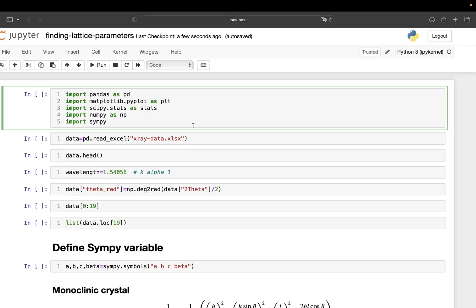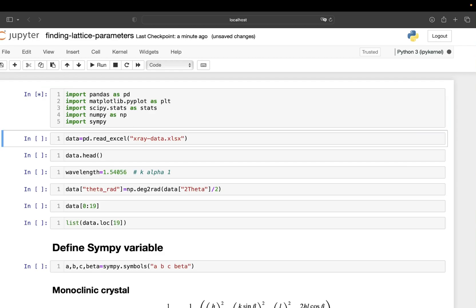Hello, welcome to this channel. In this video I'm going to explain how you can find lattice parameters from data obtained from X-ray crystallography. I'm using Python and these packages in Jupyter Notebook. If I run this cell and don't see any errors, that means all these packages are installed. If you see some kind of error, you need to make sure these packages are installed.